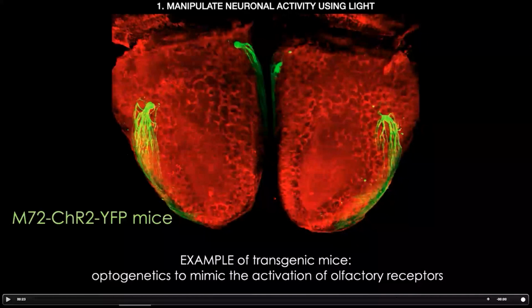So in this case, we have a transgenic mouse that is expressing channelrhodopsin, which is an excitatory opsin, under a specific promoter called M72, which is a promoter of a specific olfactory receptor, which is present only in specific neurons. And you can see here where those neurons are projecting into the olfactory bulbs.